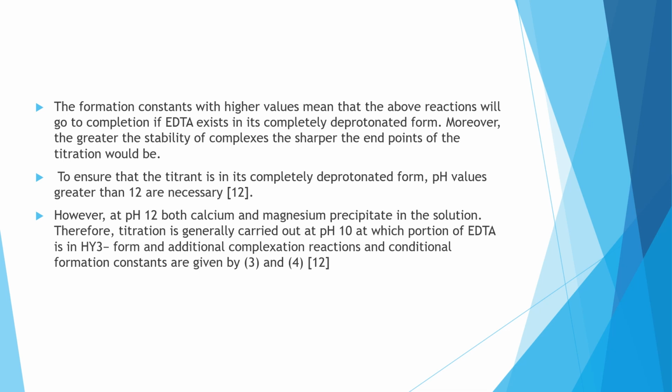Moreover, the greater the stability of the complex, the sharper the endpoint of the titration will be. To ensure that the titrant is in completely deprotonated form, pH values greater than 12 are necessary. These are basic pH values.